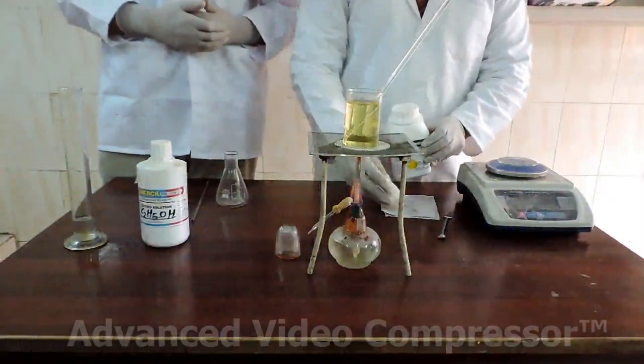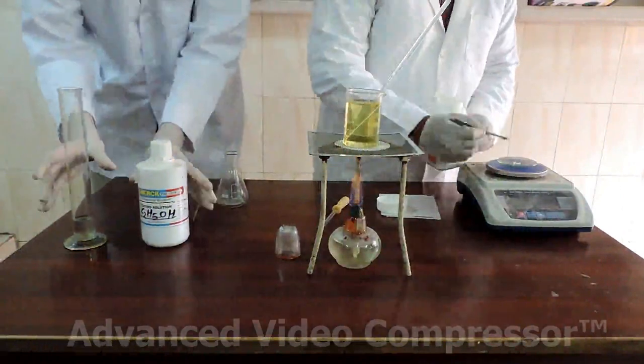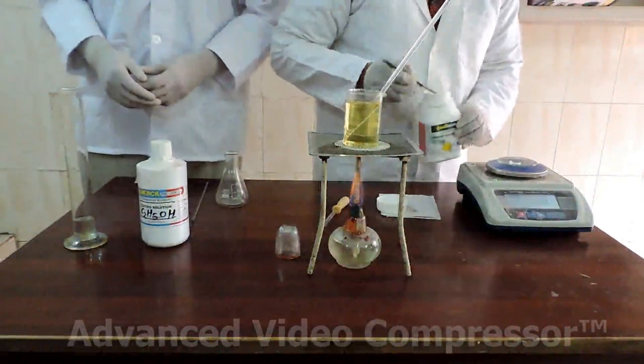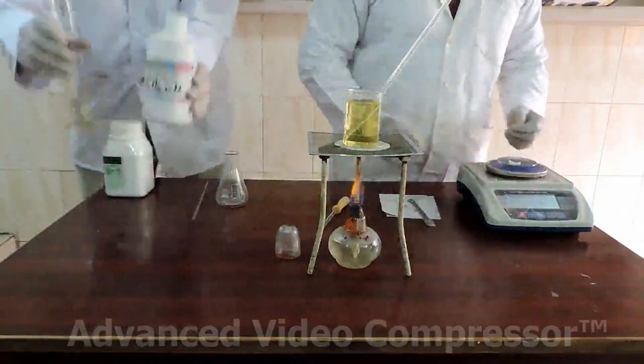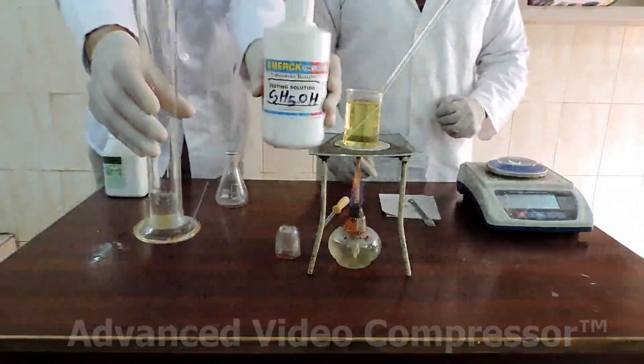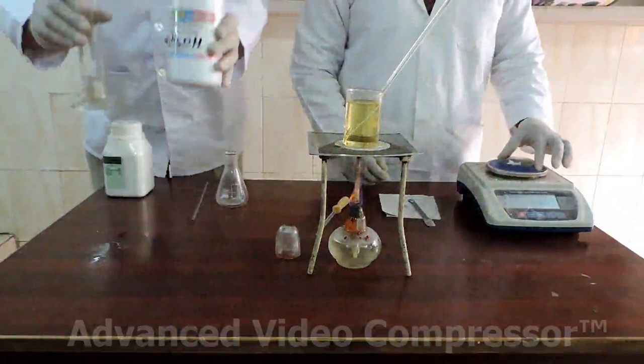In the meantime we will weigh 1 gram of potassium hydroxide and also take 20 milliliters of ethanol which you can see in the measuring cylinder.